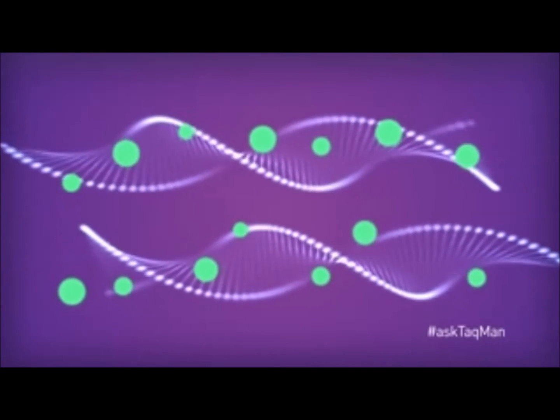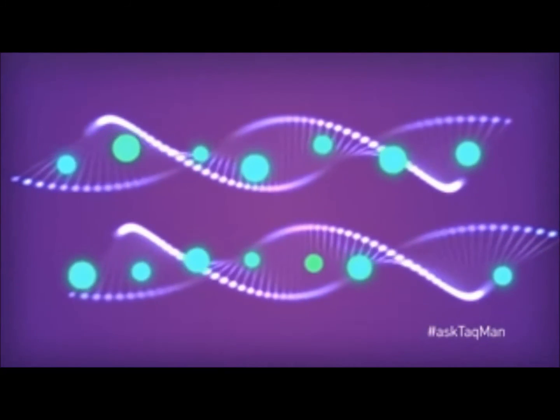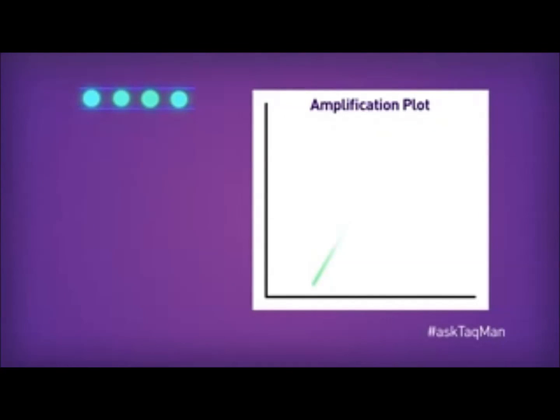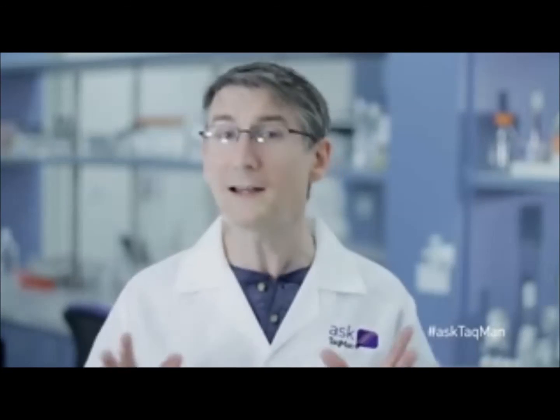But SYBR Green dye really likes to bind to double-stranded DNA, and when it does and you hit it with light, the dye gets excited and fluoresces. At least in theory, the basic idea is this. As PCR creates more and more product, the signal of SYBR Green dye goes up proportionally. In practice though, this doesn't always happen. That's because SYBR Green dye binds to any double-stranded DNA, meaning every double-stranded molecule in the tube will bind SYBR Green dye and add to the fluorescent signal.